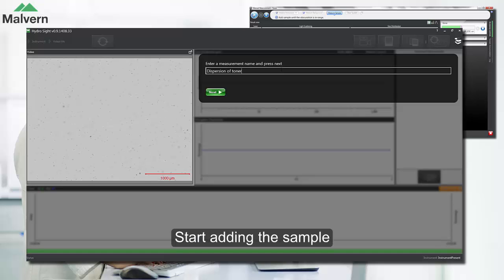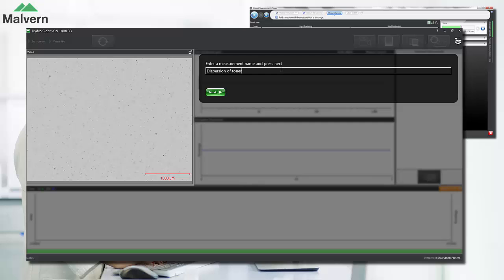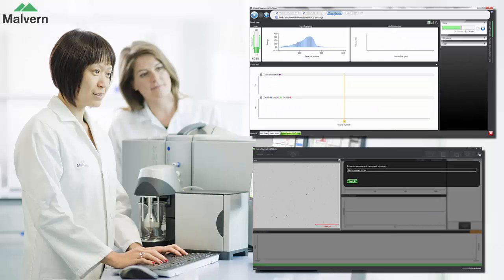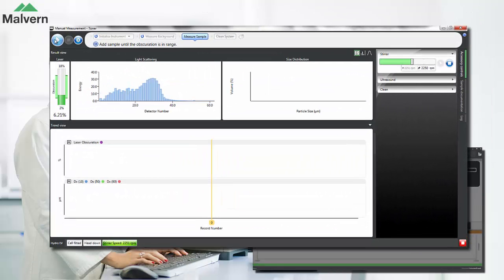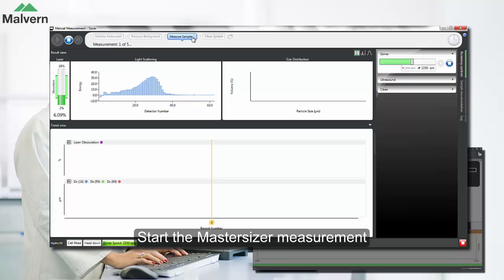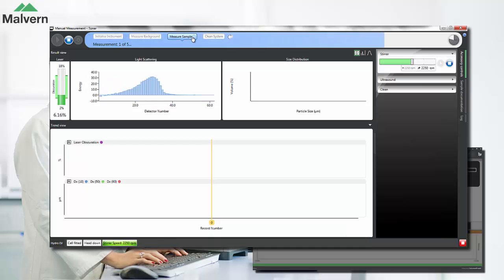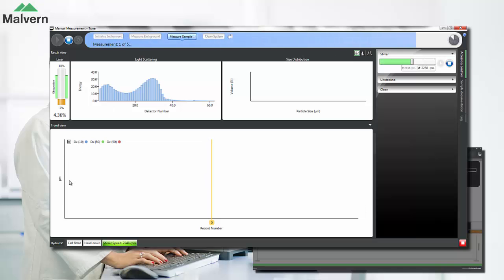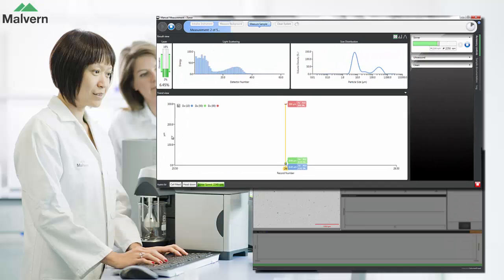We can now add the sample, and what the HydroSight allows you to do is to immediately see the particles in your sample as they're circulating around the MasterSizer. Once we've added enough sample we can start the measurement in the MasterSizer software. This will give us the particle size distribution measured by laser diffraction and will also plot the size parameters in a trend view to allow us to follow the dispersion process.